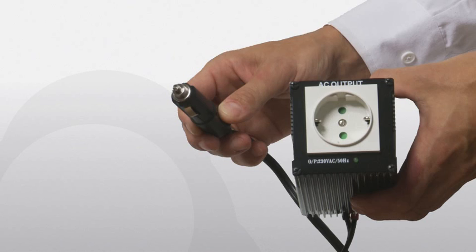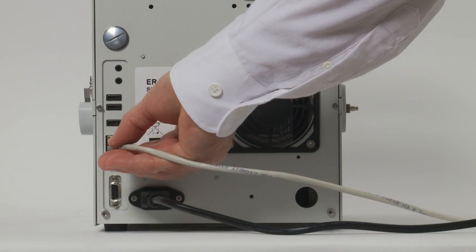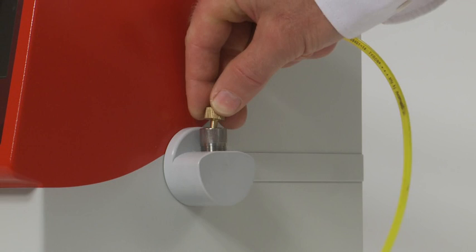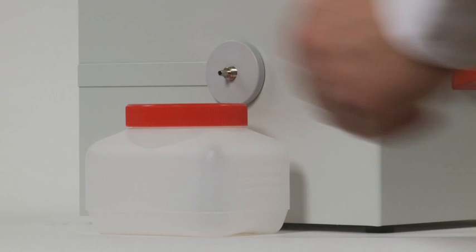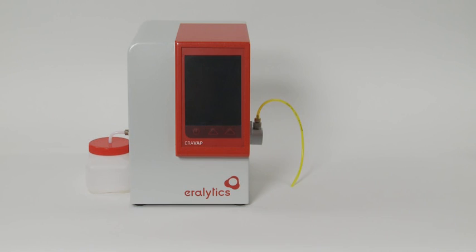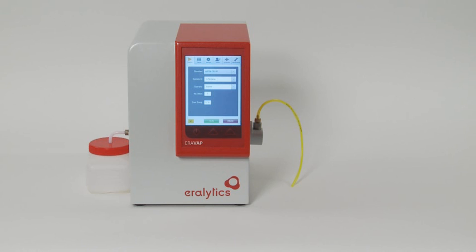For data transfer or remote control, the unit can be connected to a network by the Ethernet interface or directly to a computer or printer using the USB ports. Put the inlet tube in the lower inlet on the right side of the instrument. Then place the waste container next to the instrument and connect the outlet tube to the outlet on the left side of the instrument. Switch on the analyzer by pushing the power button on the front. After a few seconds, the instrument is ready for use.